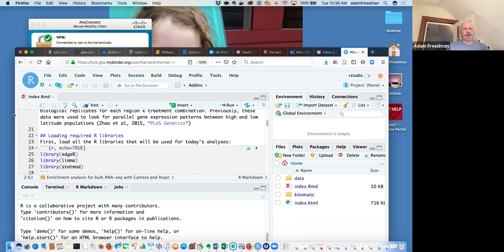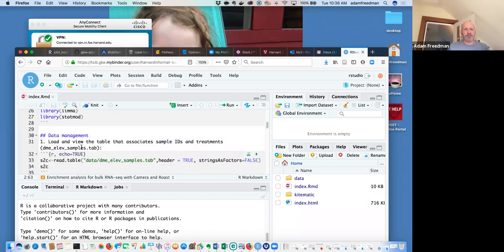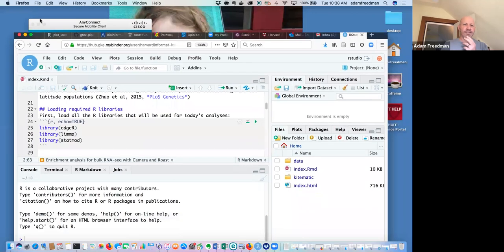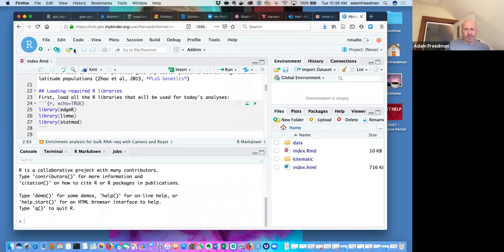But anyway, the way I'm going to do this, so I can talk a little more, since you love to hear me talk, is I'll click on the embedded links in the markdown, and you can certainly follow along with this rather than copying and pasting or live coding. I'm not going to do that, but I will explain, and you can see my screen.